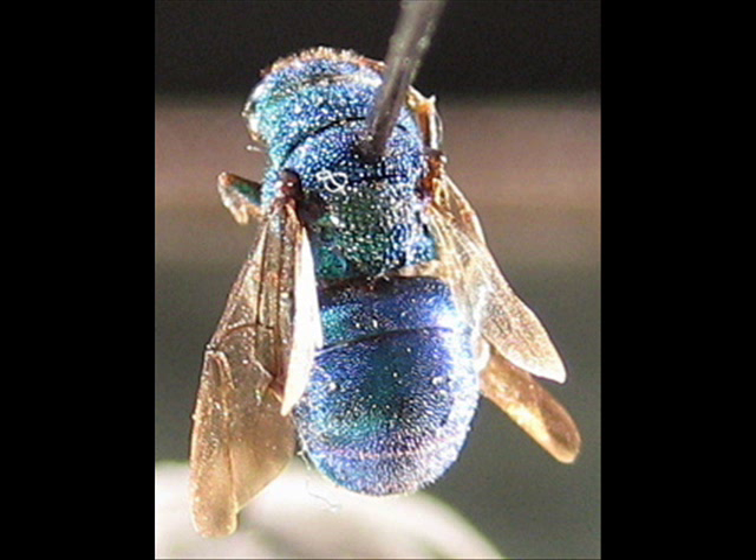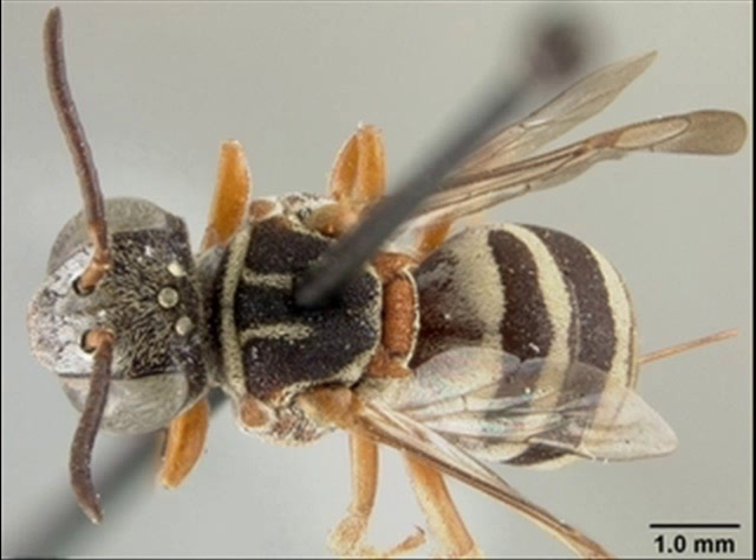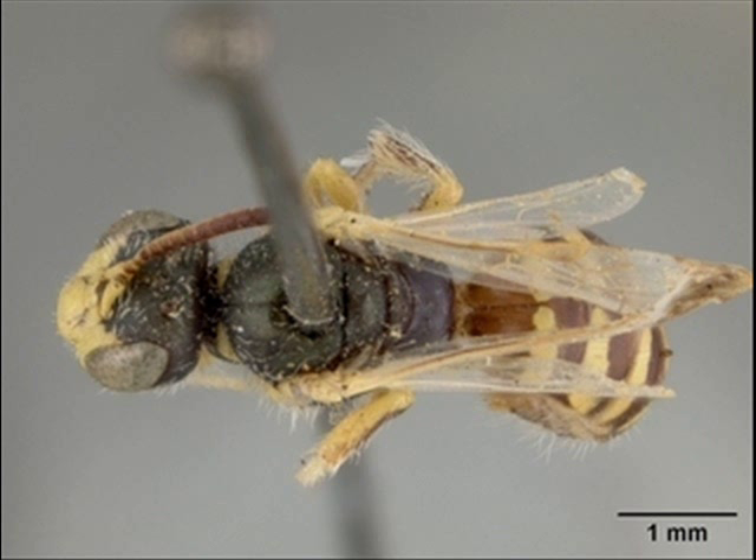Now we'll show you a series of specimens not pinned so well. Here's a specimen pinned essentially in the center — the pin is in the center of the scutum and it's going to be blocking important features. This is particularly important when the specimen is very small. We have some videos coming up that will show you how to glue specimens, which gets rid of the problem of pins going through small specimens entirely. But sometimes you're stuck and need to pin, so you need to be careful in where you put that pin.